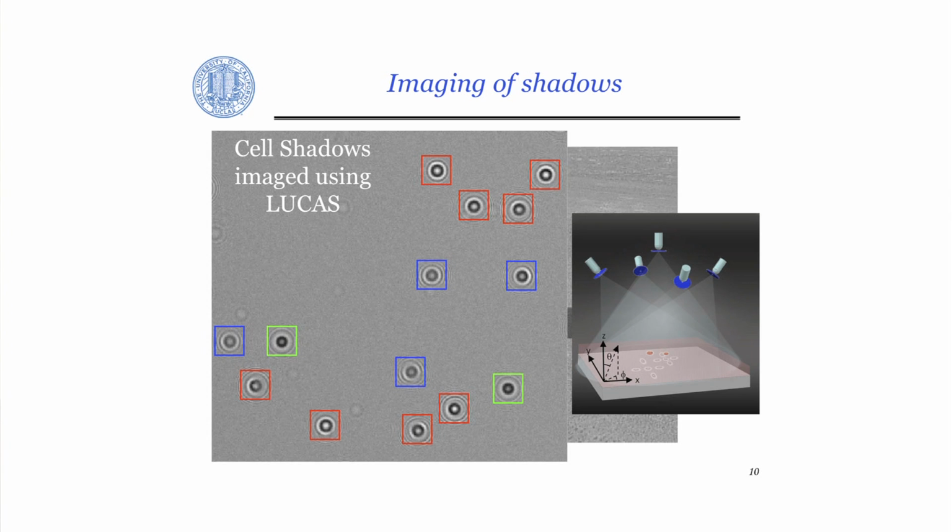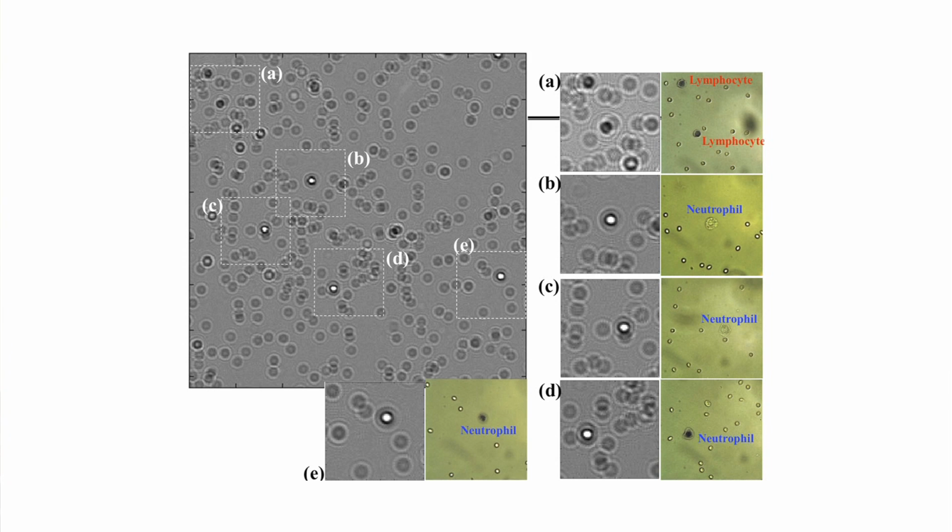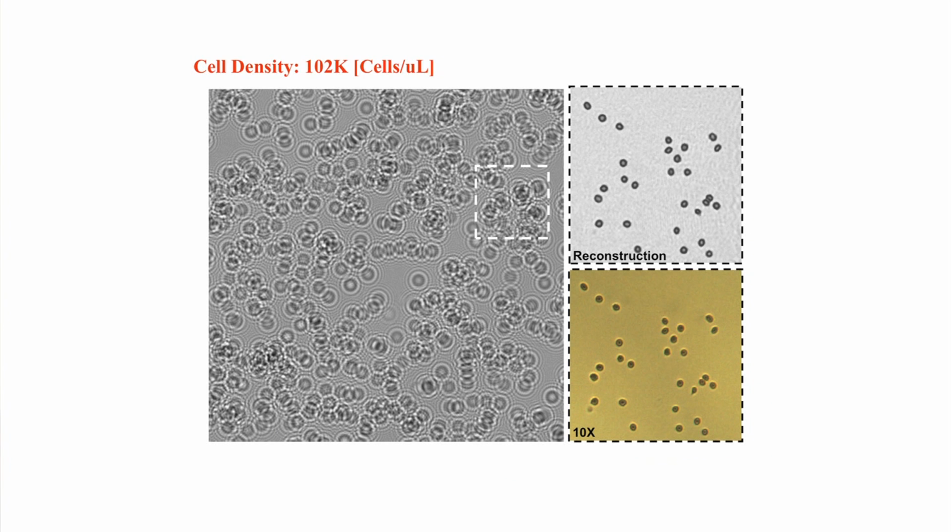And in this case, you're just using a CMOS imager with a very simple light-emitting diode, and then place the specimen very close so that they can cast at the single cell level these shadows. If you look at the whole blood, you'll be looking at mostly red blood cells. These are red blood cell shadows. And every now and then you would see white blood cells. So you can use this type of shadow imager as a cytometer. You can count cells. But of course, there are limitations, and I'll address those with some more computation.